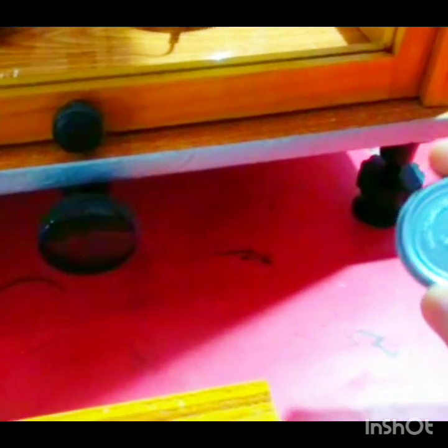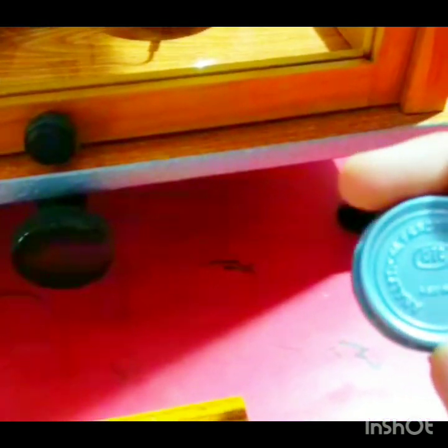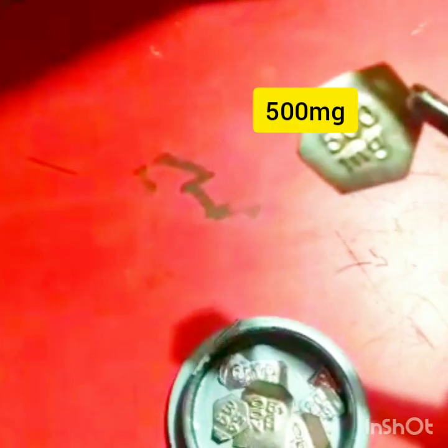Now take the weight from the standard fractional weight box. Take 500 milligrams. This is 500 milligrams. First, open the door, take the 500 milligram weight, and put it on the right side pan. Then turn it clockwise.